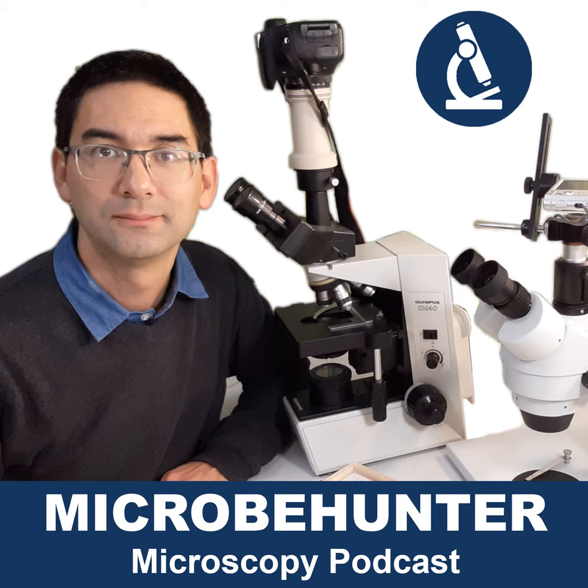My recommendation is that if you have dust on the microscope, use either a dust brush, or use compressed air, but do not use those compressed air cans that also contain this kind of solvent. Sometimes they are sold for cleaning computer keyboards or so, but you should not use those solvent containing ones to remove dust, because there is a residue that might deposit on the microscope, and it's generally also not good, because due to the evaporation it really cools down very quickly, and it might not be good for the glass elements either.